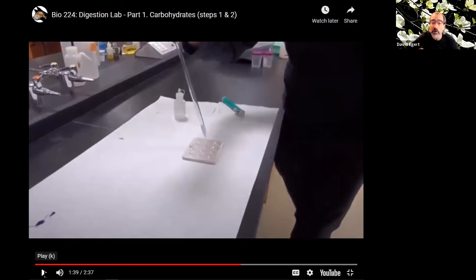Part 1 of your lab talks about this. In your lab write-up, you'll be writing up the results for those different test tubes that you did for your pre-lab, but you also do want to include this. Use your observations from this video, describing what you see when we add the acetic acid to the saliva, and what it means. Here you're seeing me take some of Becky's spit, put it in a little spot plate, and then I'm going to use acid to precipitate out the mucins. Those are the polysaccharides that make the mucus all slimy and yucky.